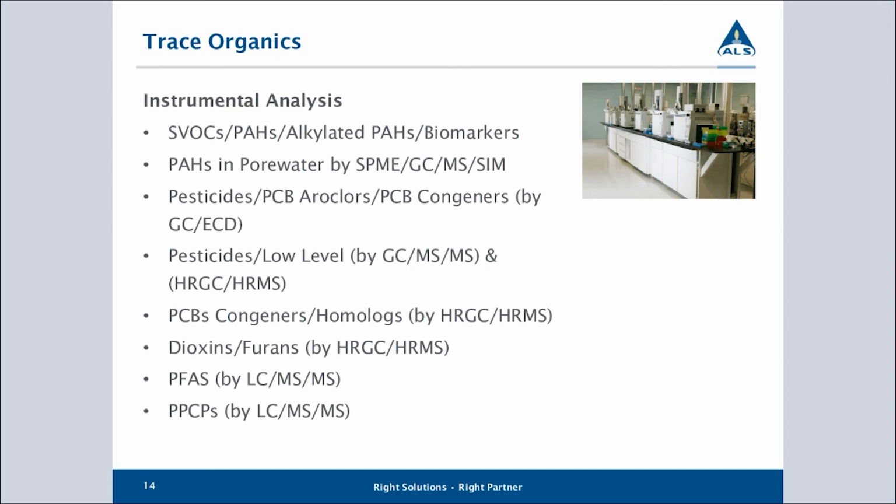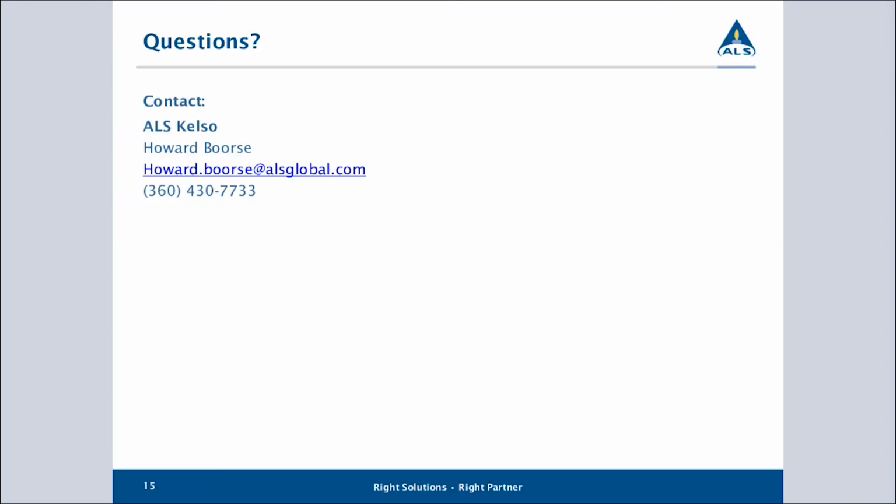Pharmaceutical and personal care products have become what I would call maybe an emergent contaminant for tissues. For sediments, we've been looking at them for the last 10 years plus, but considering the other contaminants, which we've been looking at for much longer, pharmaceutical and personal care products have been of more interest in the sediments arena just to use as investigative work determining sewage tracers from POTWs and non-point source discharge, as well as laying blame on maybe POTWs that aren't working properly. But yeah, it's certainly something we see more and more of on a daily basis. So that's kind of it.